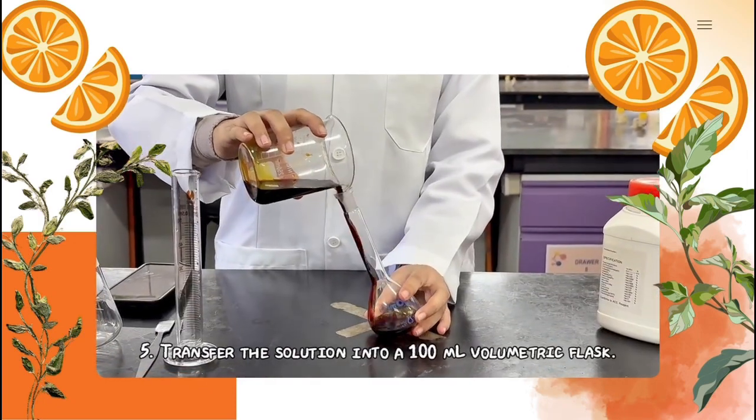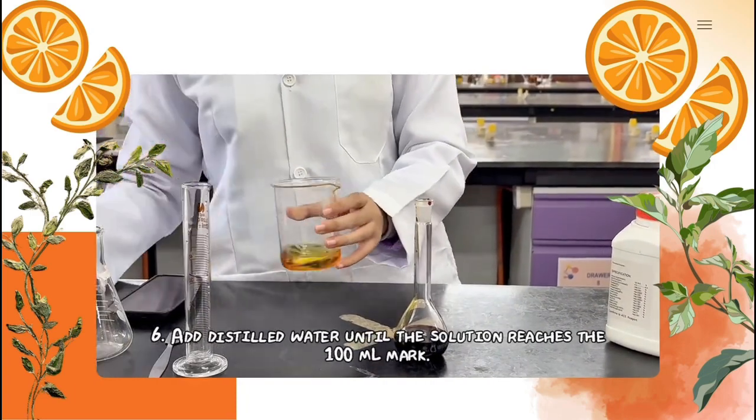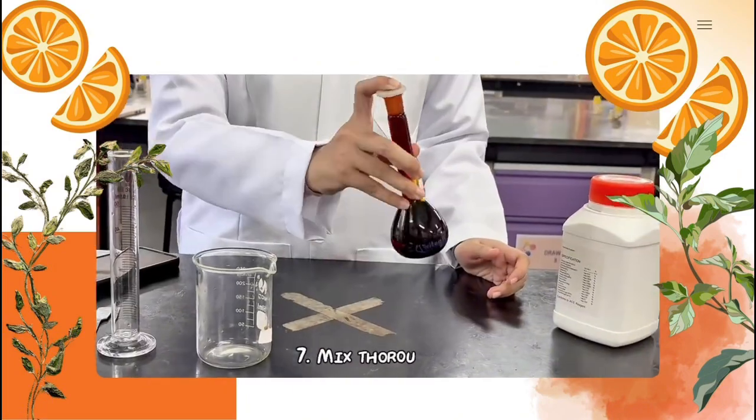Next, transfer the solution into a 100 ml volumetric flask. Then, add distilled water until the solution reaches the 100 ml mark. Lastly, mix thoroughly.